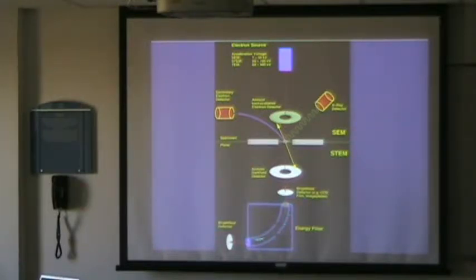What we then sometimes have is an additional so-called energy filter. And the energy filter, in principle, is a simple thing. It is a tube which is bent 90 degrees. And you know, when you come with a charged particle and you hit the magnetic field, you get a deflection. That's the same thing actually the lenses work too. So you hit an electric field or a magnetic field, and you get a deflection. And depending on your speed, you can just change that magnetic field here. Depending on your speed, they either make it through, or they hit the walls. If they're too slow, they hit the wall up here, and if they're too fast, they hit the wall down here. And if they are coming just exactly right, then you get them through.